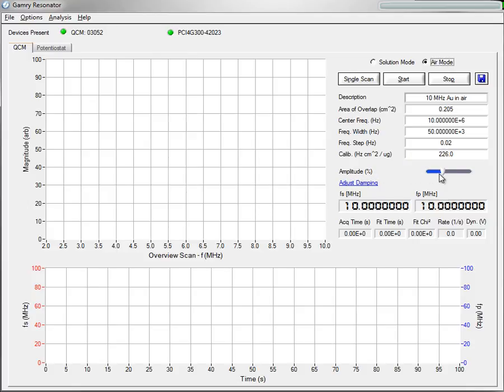Amplitude, you're going to be running probably a lower amplitude than you normally would. This is because we don't need to put as much energy into the crystal when operating in Air Mode.